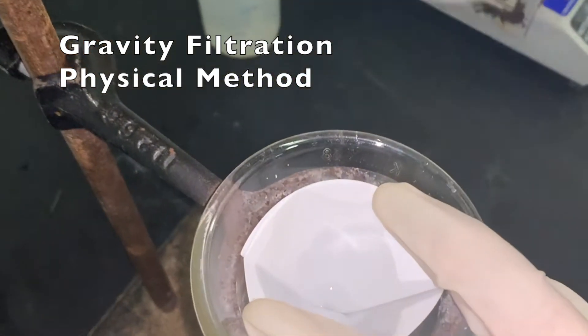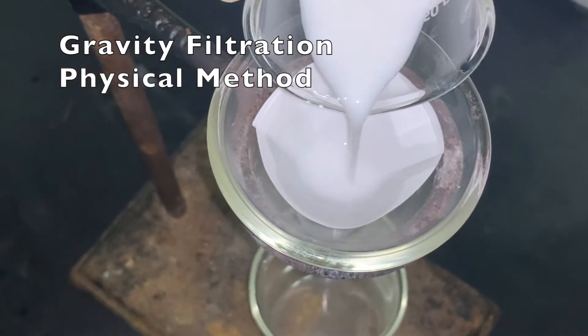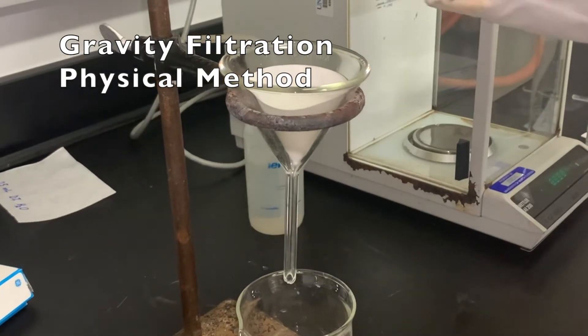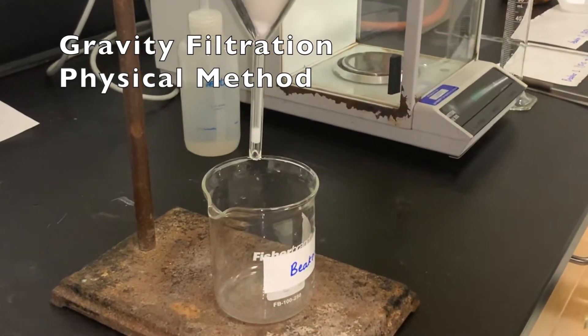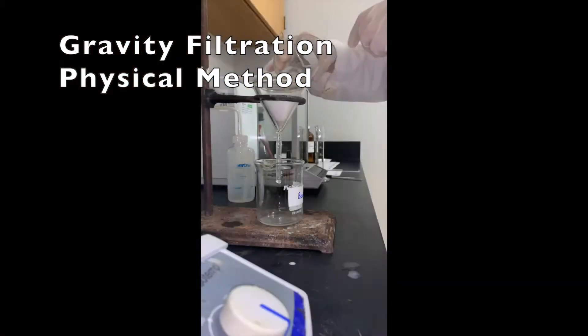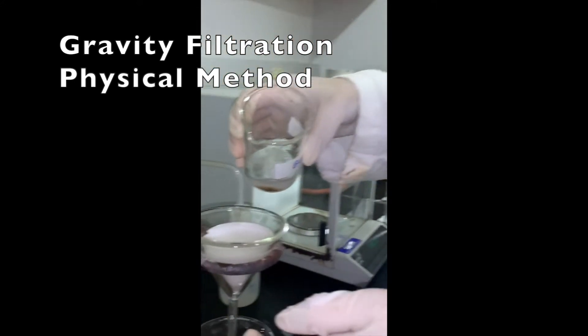Now I'm going to filter this. The filtration takes a few minutes — approximately 10 to 15 minutes sometimes. Make sure to take all the solid; for that, add a little bit of water and then pour it. Make sure the level of liquid should not go above the filter paper, otherwise the solid can go down into beaker number 2.